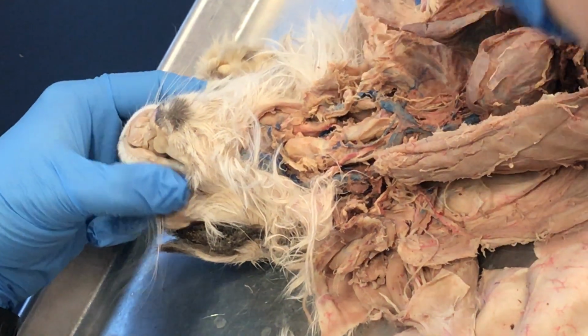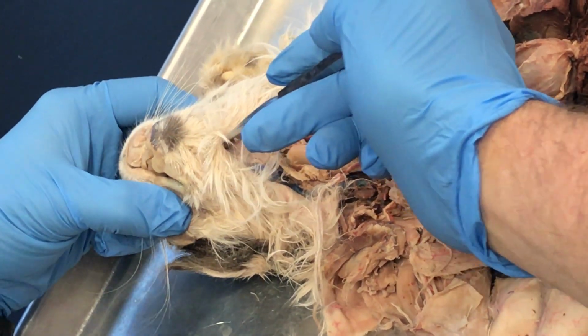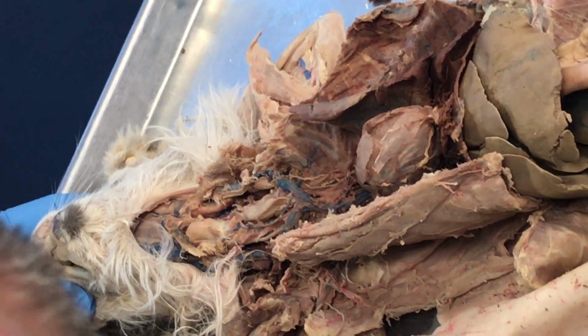So I think maybe we got a cat or two that they've cut and dissected, and you might be able to see them in this area. If you want, you guys can do the dissection as well. If I see good parotid glands or salivary glands, I might put those on the test. If not, we won't. Okay?